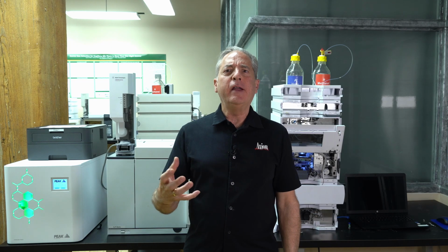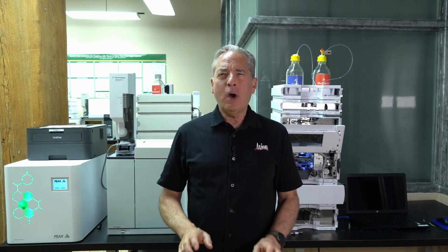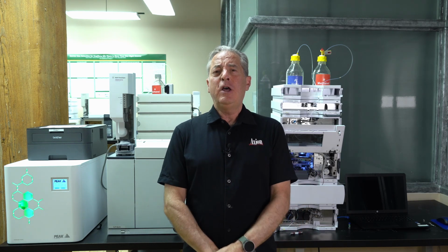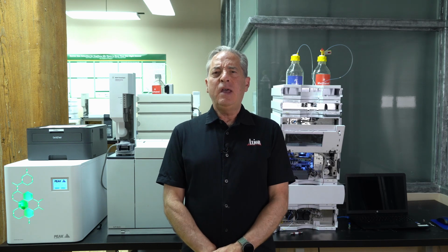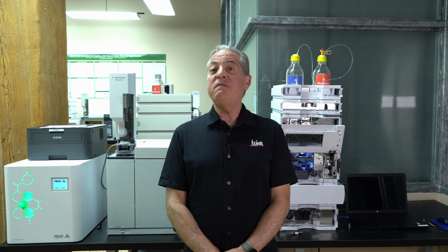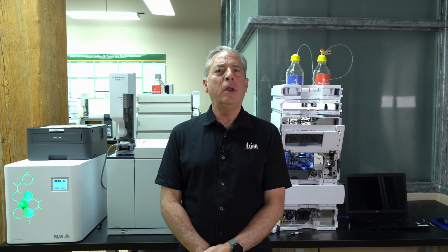I have a cup of coffee here. What do you need to do to that before you could stick it in the instrument? So I have a couple of suggestions for that answer. The first thing is in the GC. The GC can analyze anything that's volatile. Anything that we can vaporize is going to blow right through a GC and cause no harm and no damage.